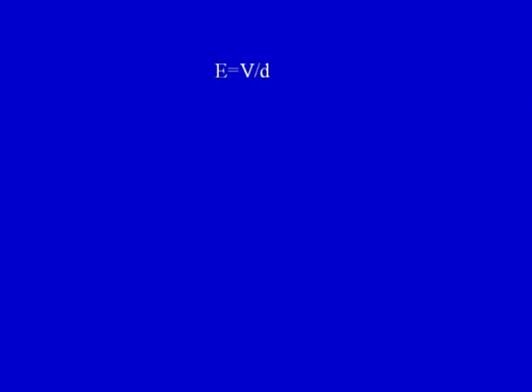All right. So, let us get into a little bit of the basic principle of electrophoresis, of which I have given a little overview. When a potential difference is applied across the electrodes, it generates a potential gradient, which is given by E, the applied voltage divided by the distance between the electrodes. That is, E equals V upon D, voltage upon distance between the electrodes.